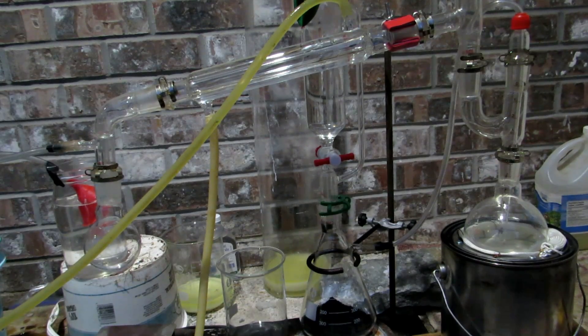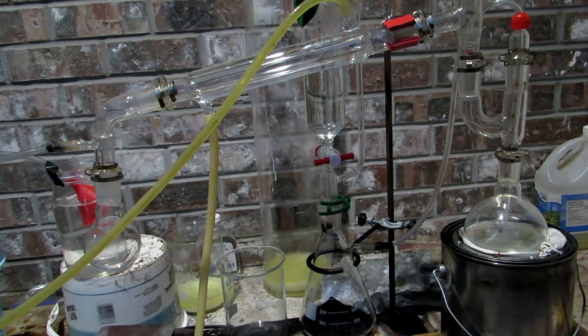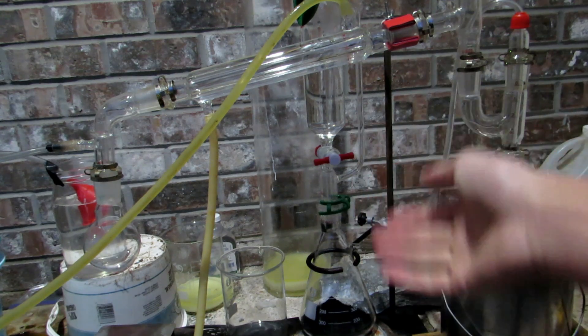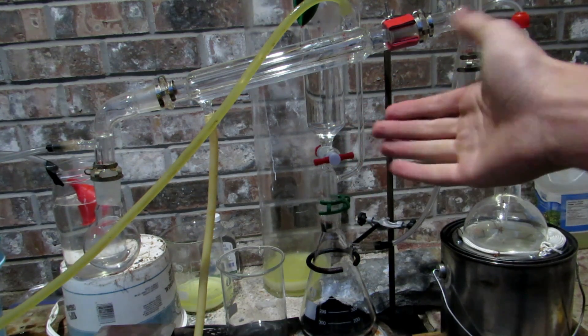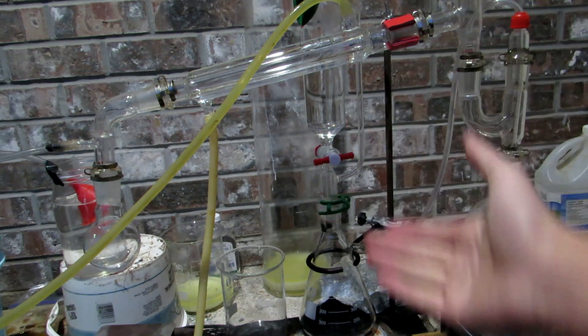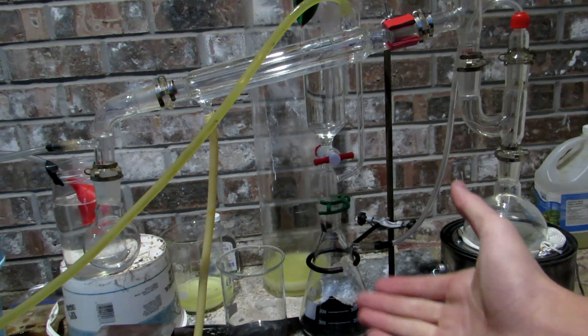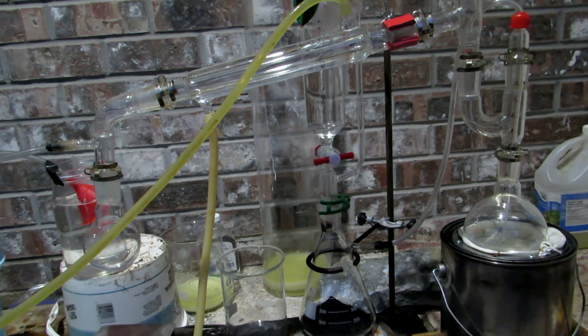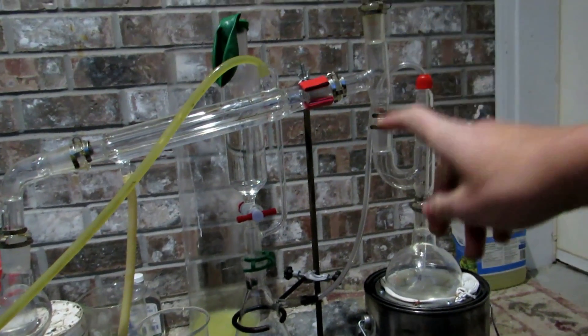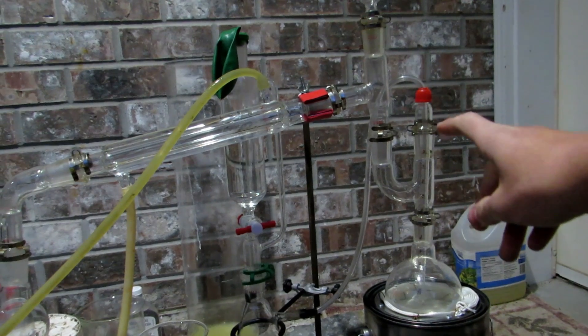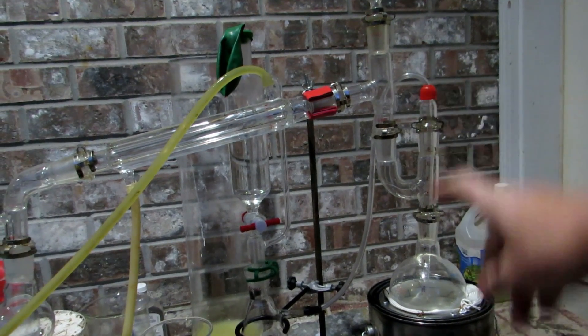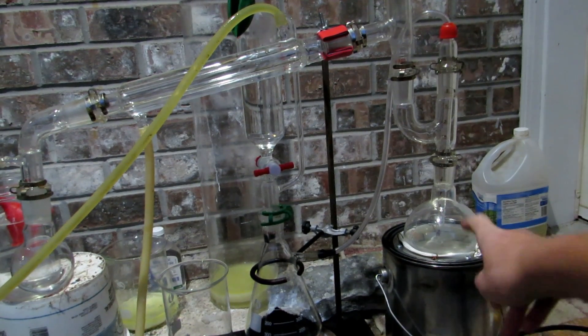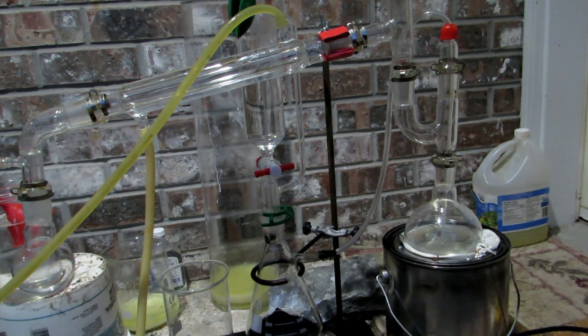So we have all of our apparatus set up here as you can clearly see. It is rather complicated but not too bad. We have a gas generator with an addition funnel on top and it's totally sealed and there's our hydrochloric acid in there. We've loaded the manganese dioxide into the bottom and a hose has been attached which runs into the top of our apparatus. It's then attached to a glass tube which goes all the way down into our solution and bubbles through our solution of potassium bromide which is in this 500 milliliter round bottom flask.